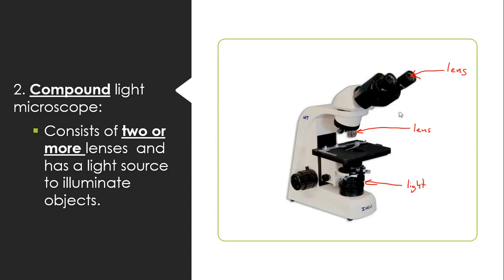Okay, so this is known as compound because we are using two lenses, and we're using the power of both of those lenses combined to magnify the image.